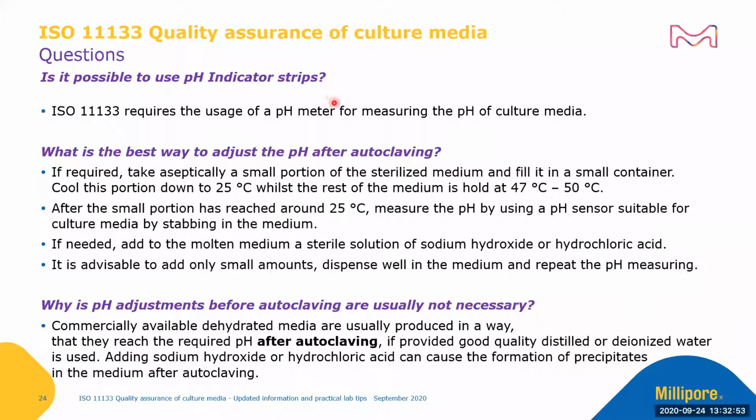Is it possible to use pH indicator strips? No. ISO 11133 requires the usage of a pH meter. What is the best way to adjust the pH after autoclaving?